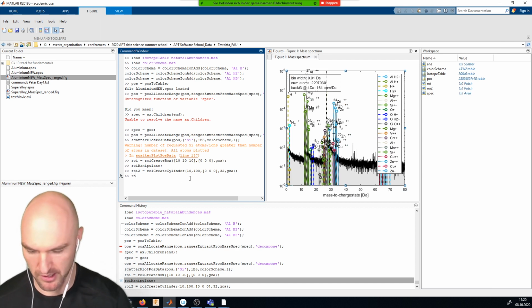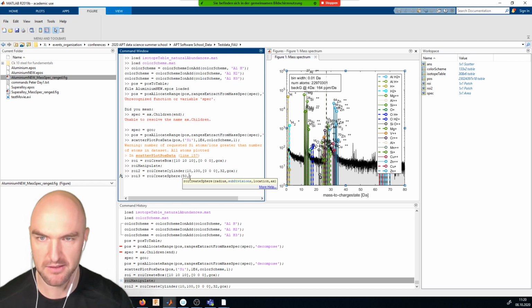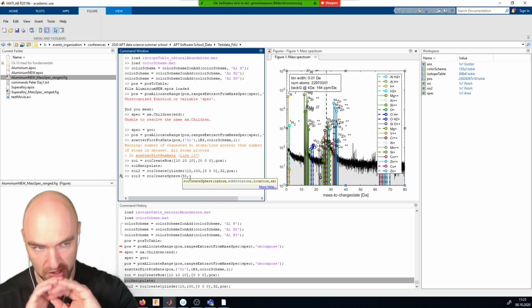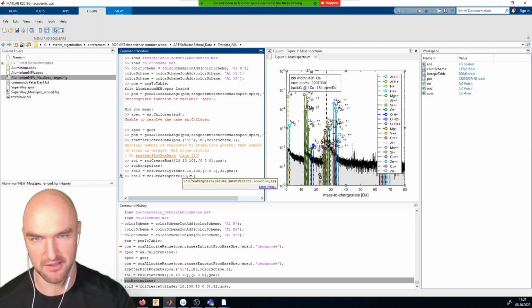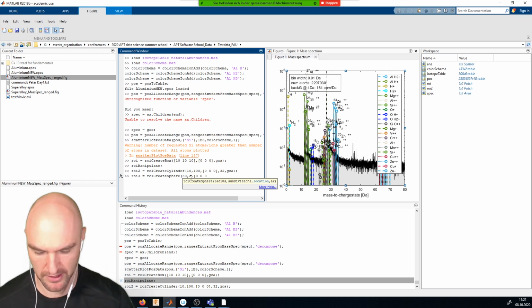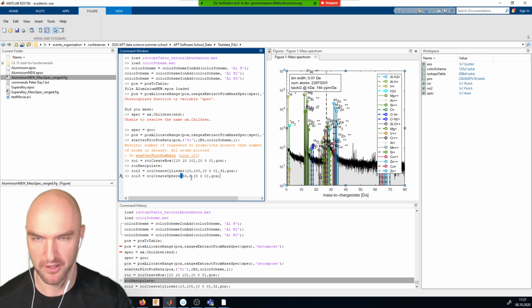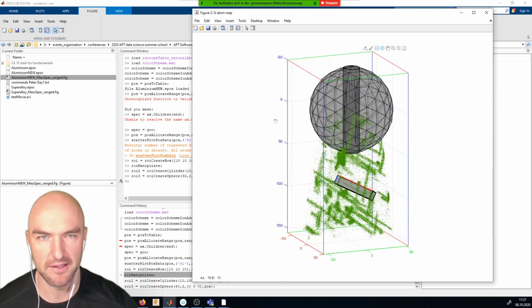And similarly, we can go ROI 3 equals ROI create sphere. For the sphere, we can have a radius, obviously, only. Let's make it 50 nanometer radius so we can see it well. And then we've got the same thing. It's actually made from triangles, and we need to say how fine we want the subdivisions of those triangles to be, and I'll just use one with subdivisions 2. You can look up Catmull-Clark subdivision surfaces to see what the subdivisions mean. And the location is going to be 0, 0, 0 again. Just put it there. And in the current axis. And now you can see we've got the sphere as well.